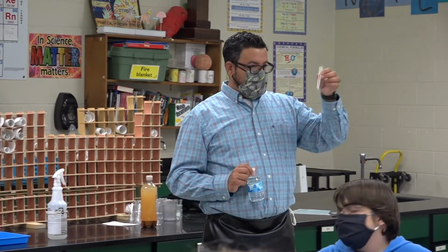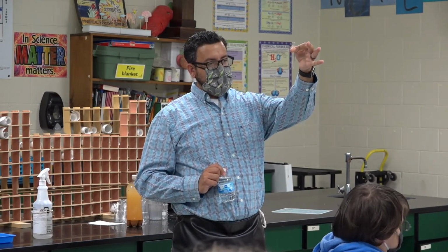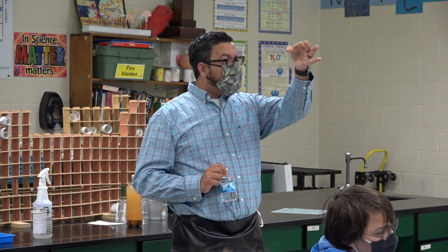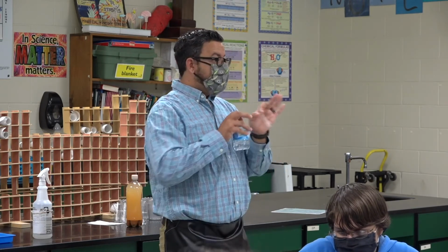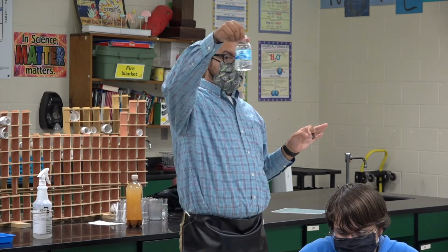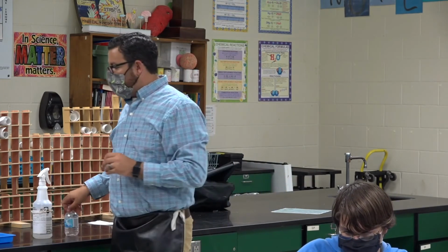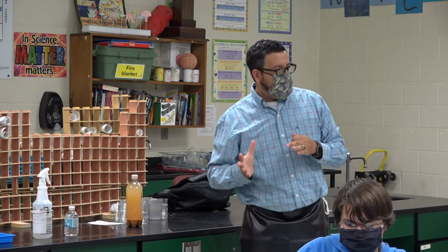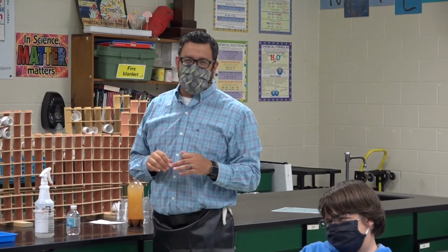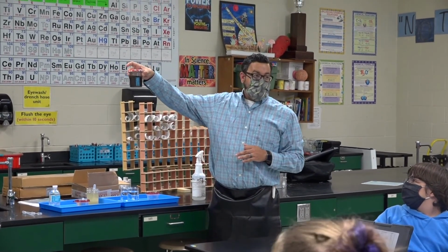When it's in your test tube, if you hold it up to the computer, and you can see every single bit of information that's on your screen, oh, I can read every single word, that would be like a 0 on the scale. There is no light being blocked whatsoever. Like that, right? You can see right through it. Make sense? All right. Something, though, that you hold it up and it kind of makes it foggy. It's kind of in between. You can see some light passing through, but it's not very clear. If it's completely dark and you can't read through it, oh, ew, that'd be like a 9 or a 10 right there.